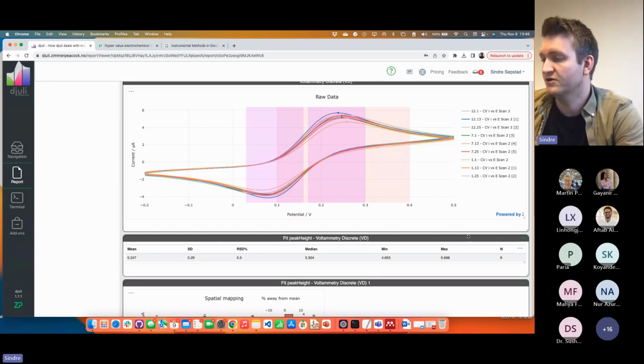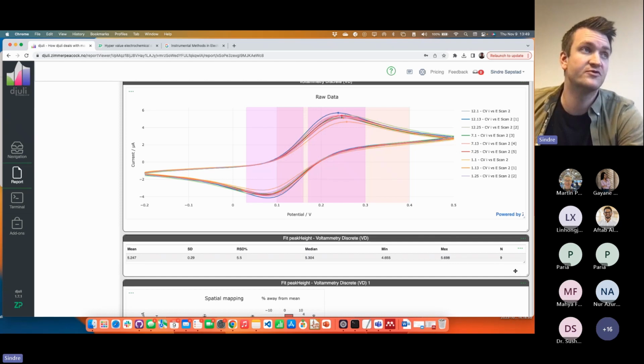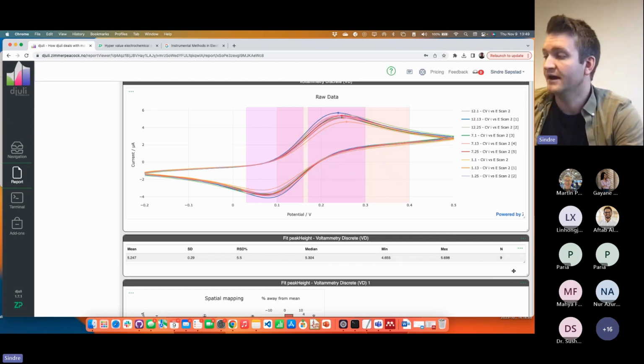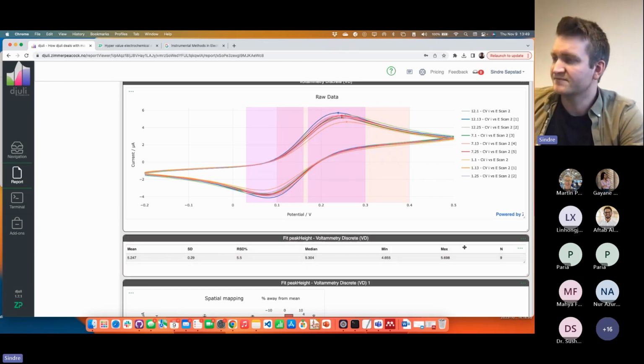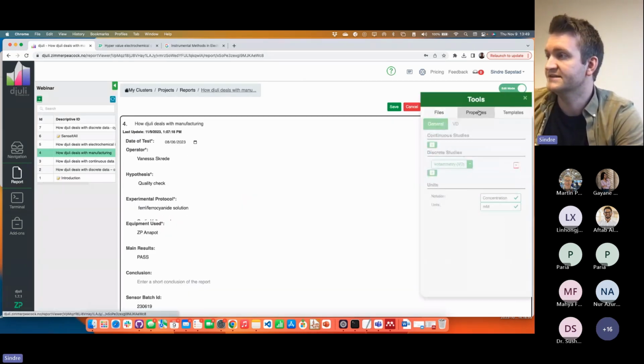This applies also for the analysis that Lynn did. You don't have to go and specify all these time series every time if your data is looking similar. This becomes especially handy when you're working with a maturing product where the tests that you perform are standard, and you only want to perform the same analysis over and over again. So this is the real time saver. I'll take you over what I've done here just by clicking into the settings.